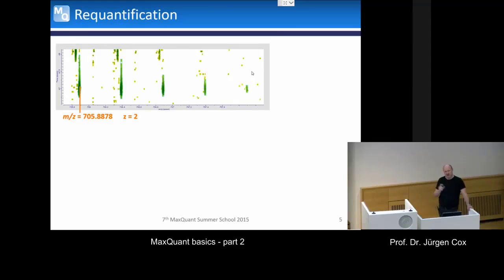So they stay alone as features where it's not clear if it's a heavy or light peptide per se. What we do with those is we still want to identify them, and if they have an MSMS spectrum attached, then this spectrum will be submitted to the Andromeda search with the labels as variable modification, because we don't know what it is.